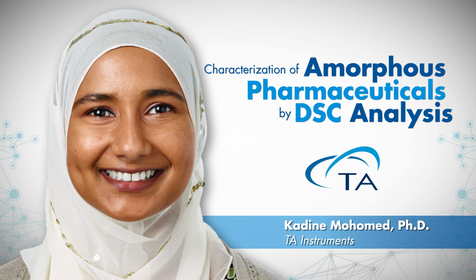I have found that also in cases using a helium gas purge, which has a higher thermal conductivity and better heat transfer properties than the typical nitrogen gas that we would use for the DSC experiments, that can improve the ability or sensitivity in your measurement as well. Modulated DSC as a technique increases sensitivity and resolution. I would certainly give modulated DSC a try as well. Okay, thank you.